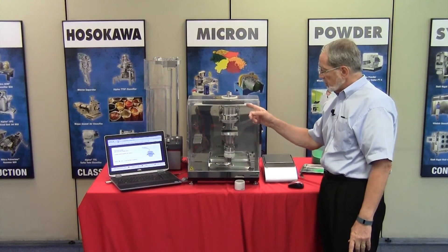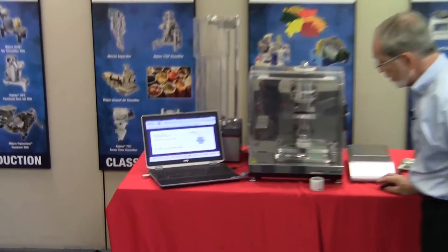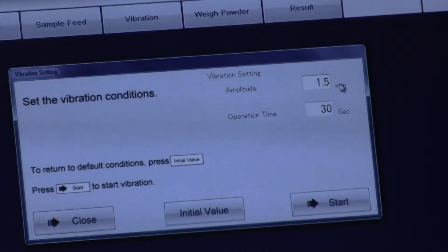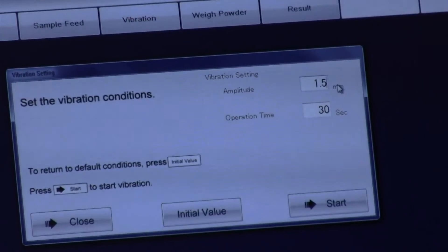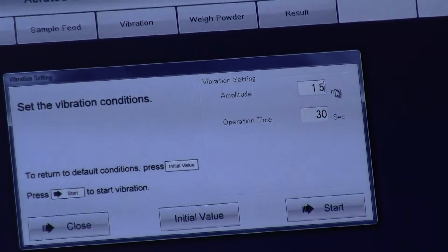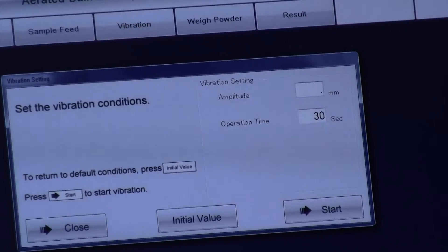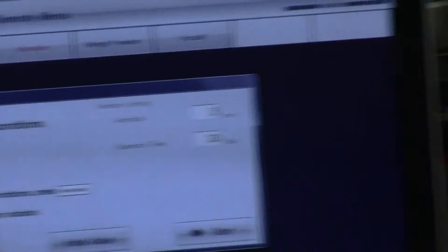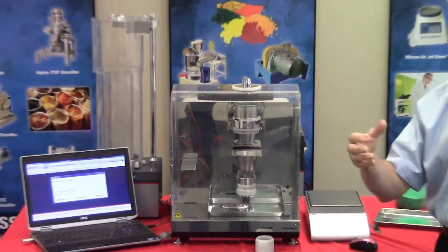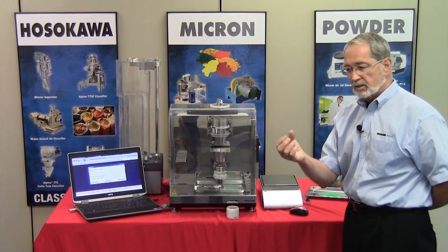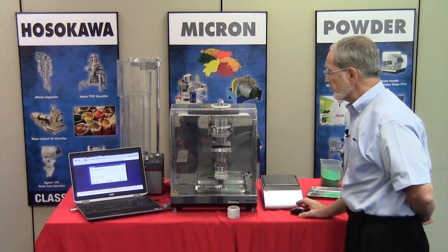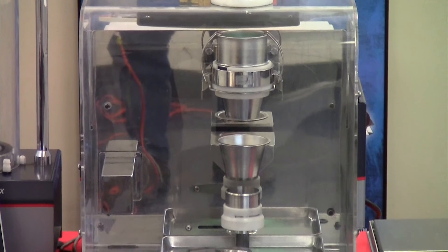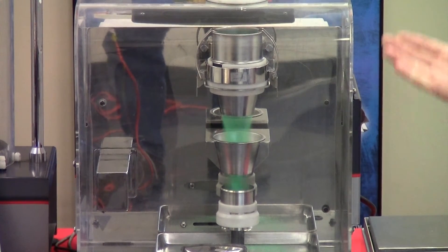Now that the cup has been filled with the sample material, we press the next button to advance the software and change the amplitude of vibration. Because this particular material flows extremely well, we reduce the amplitude to 0.5 millimeter. You can increase the amplitude if the material becomes more cohesive during the process. We press the start button and the material begins filling the cup.